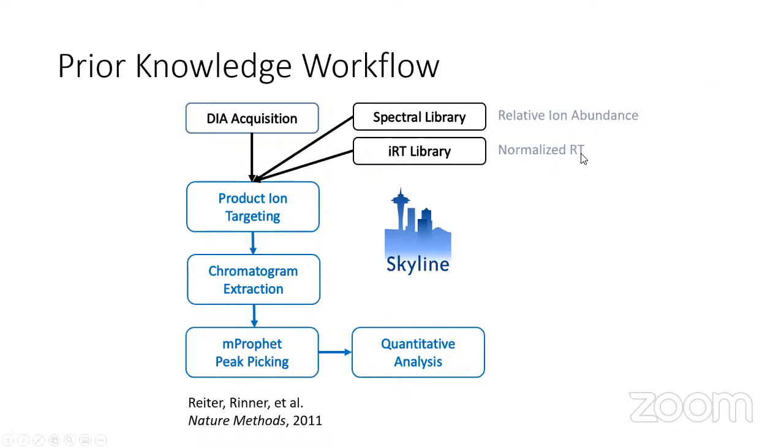Sorry, it's a little bit relevant to this before we move on. Timothy is asking, yesterday we heard that the fragmentation energy is fixed in DIA, but often not in DDA. So will DDA spectral libraries need to have the information stored to make them useful for DIA?